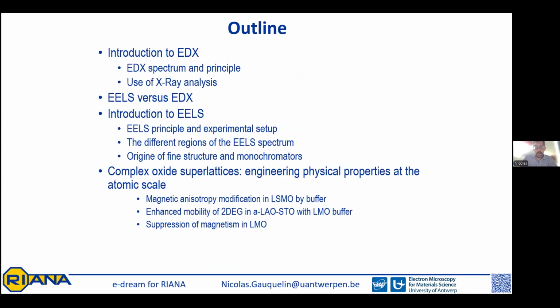So here's the outline of my talk. I'll first introduce EDX, then discuss the advantages of EELS against EDX and what the drawbacks are. Then I will introduce EELS and move on to some application-related topics, and go into complex oxide superlattices and how you can learn information about those complex structures at the atomic scale from electron energy loss spectroscopy.